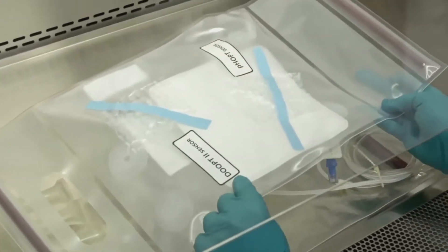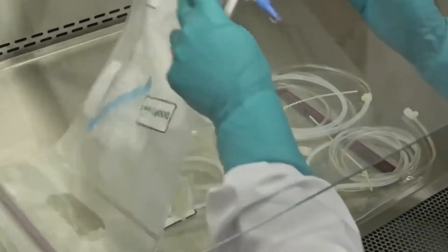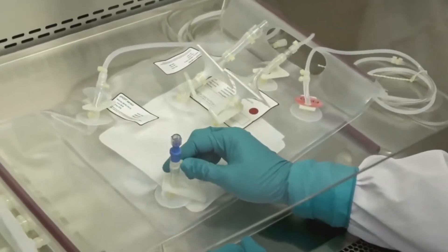You also have a DO sensor and a pH sensor, and we'll leave those bubble wraps on until we get outside of the BSC. Your cell bag is now ready to be installed on the W25 rocking platform.